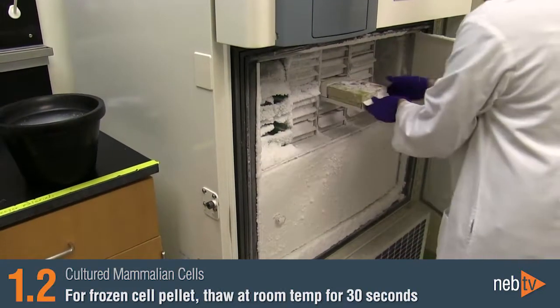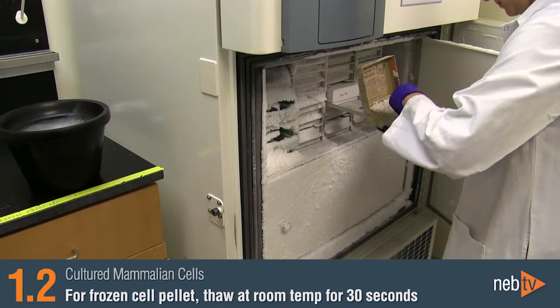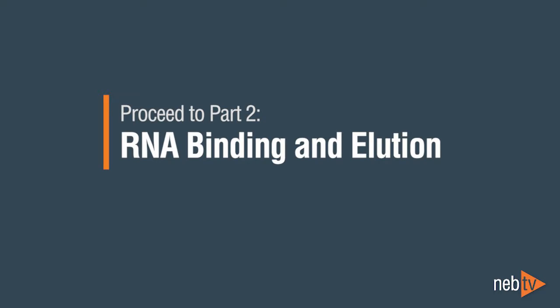For a frozen cell pellet, thaw the pellet briefly at room temperature for approximately 30 seconds before resuspending in lysis buffer. Now you are ready to move on to Step 1 of Part 2, RNA Binding and Elution.